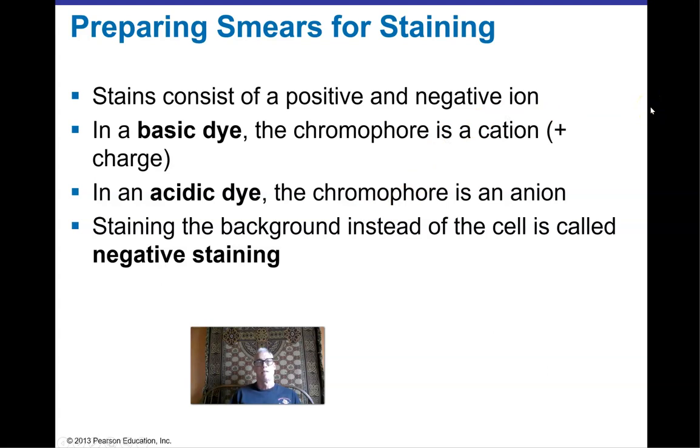Basic dyes are positively charged colored chemicals. Most dyes that we use in microbiology are basic dyes because they stick to lots of negatively charged proteins and structures within our microbes. So that's the most common thing we're going to use, basic dyes. We have a simple basic dye, which is a single chemical.